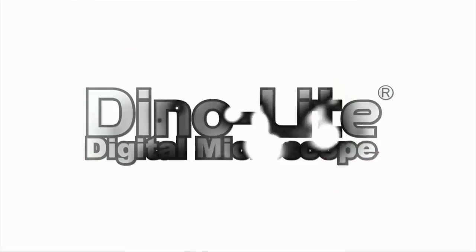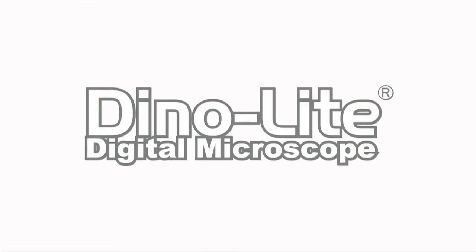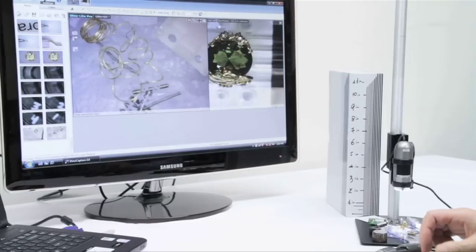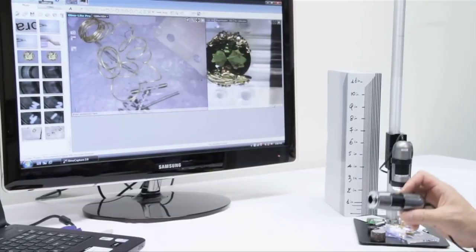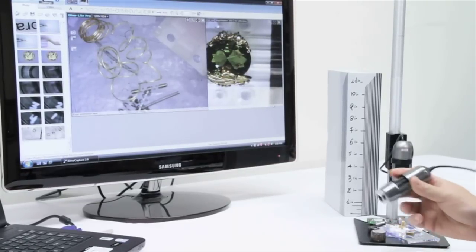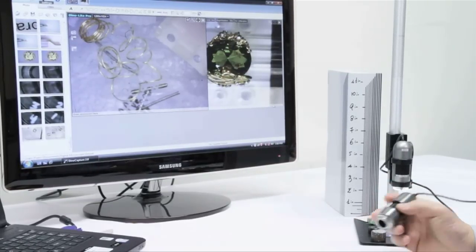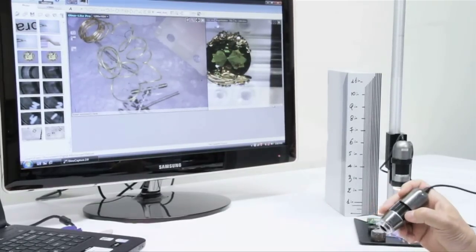Introducing the AD4013TL. This model goes from anywhere from about 10 to 92 times the magnification.